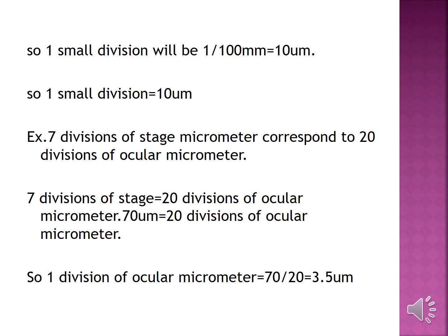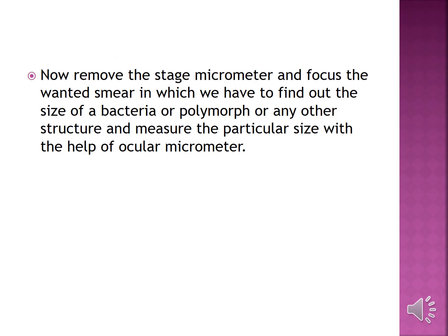So this is a calculation. Now remove the stage micrometer and focus the required smear, in which we have to find out the size of the bacteria or polymorph or any other structures, and measure the particular size with the help of the ocular micrometer.